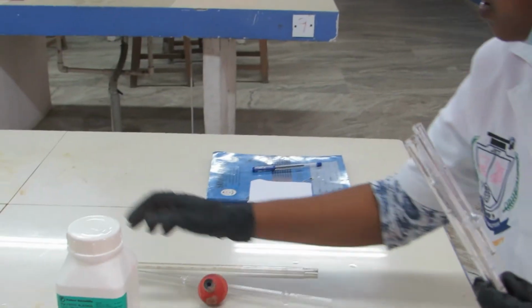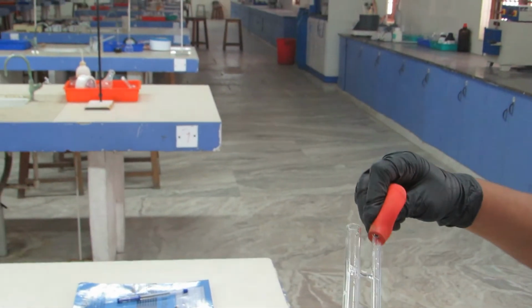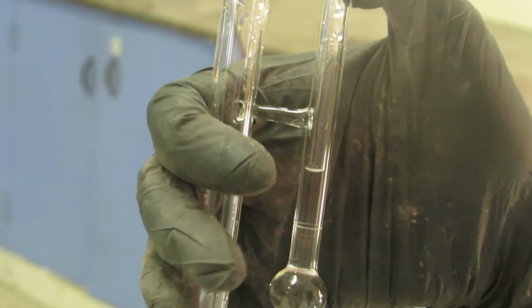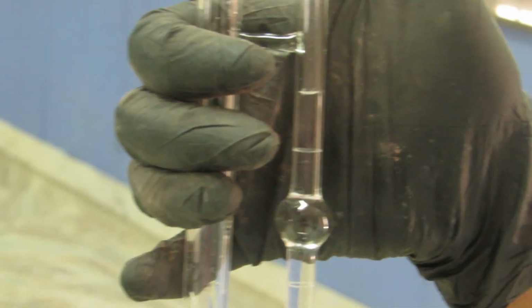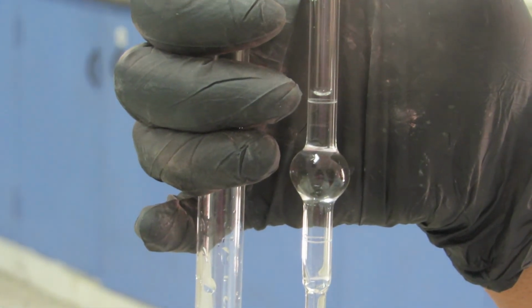You see that calibrated mark, and we have to control the flow of water. We have to control the flow of water by closing the lid on the left side with a finger. Slowly we have to release the water. Just you see here. Slowly we are releasing. Just clearly we are seeing it. You see that? Yes. Exactly at that point we have to stop it. And we have to switch on our stopwatch. Okay, both at a time.